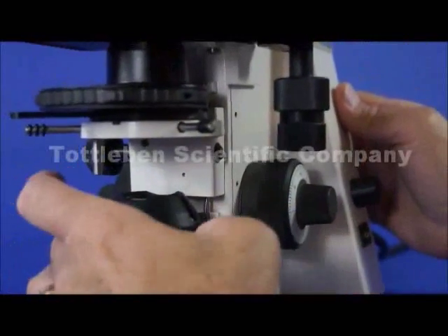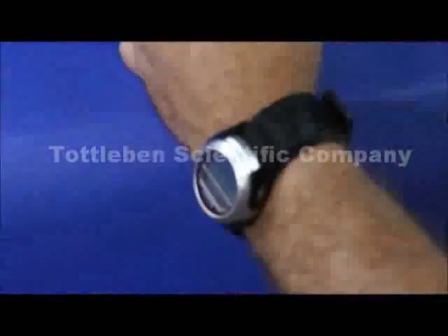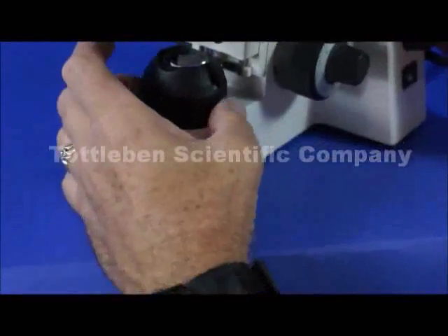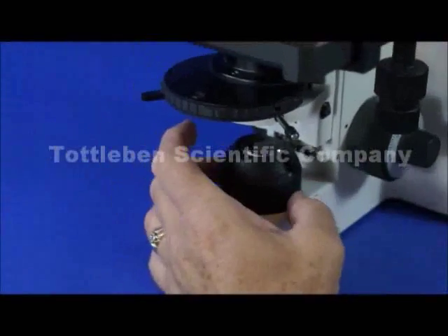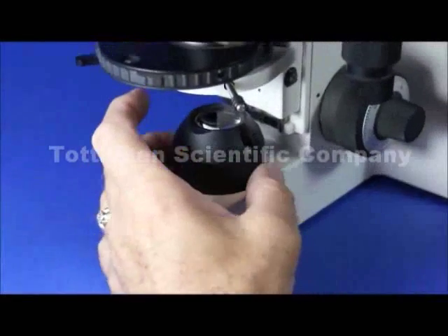Going straight down you have a field port which has a built in diaphragm for centering the condenser and aligning the light path through the condenser which is called Kohler illumination.